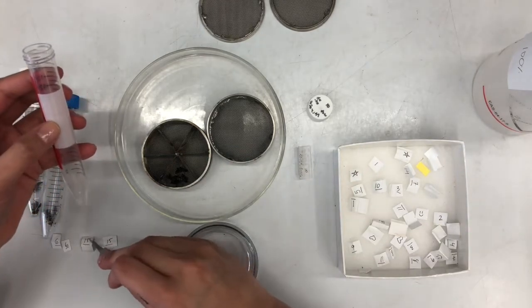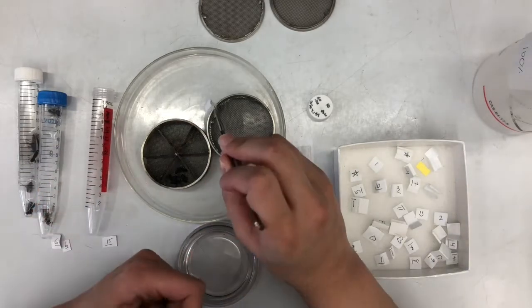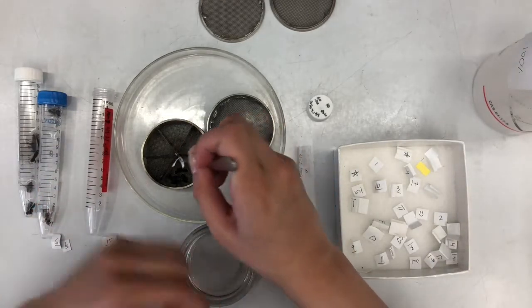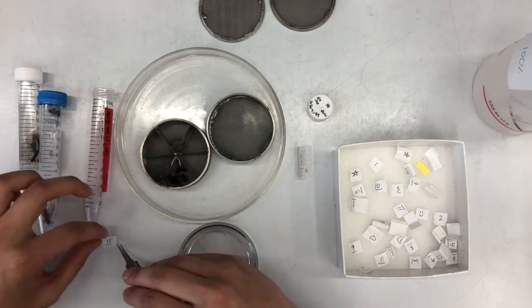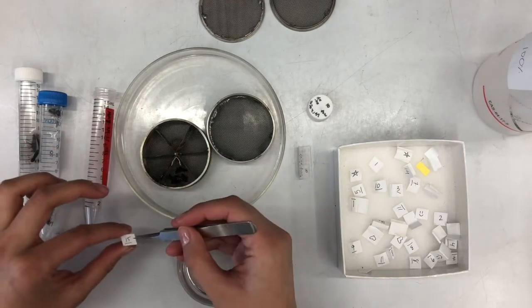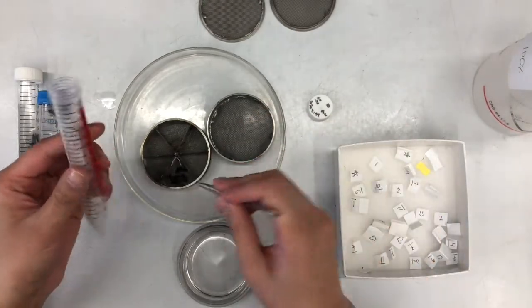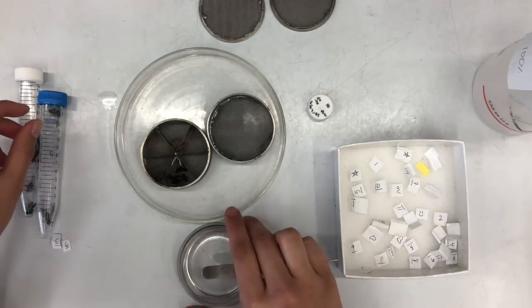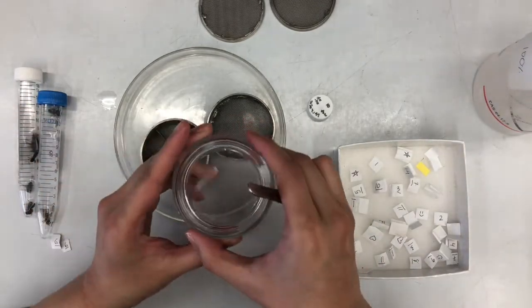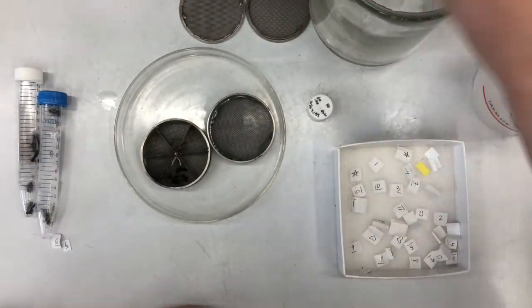Take one of the labels - I'll grab this 15 - fold it up and put it in the corner of the cage section so it doesn't get in the way of the specimens. Take the paired 15 and put it into the tube with that label. Now I know that the tube with the 15 matches the 15 inside the cage, and all those specimens will later go inside that tube.